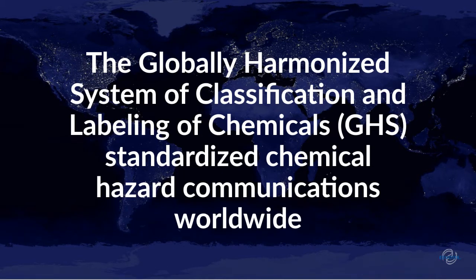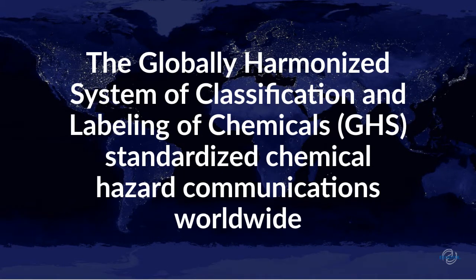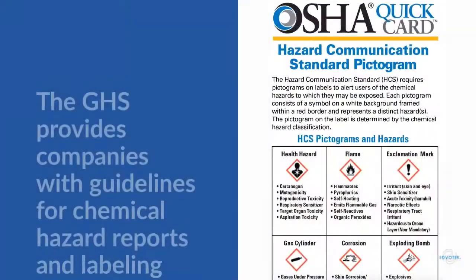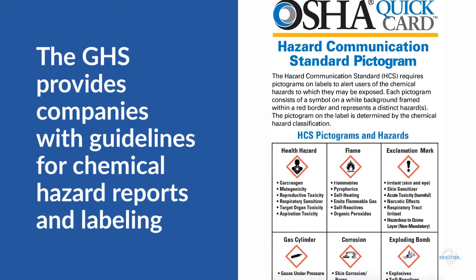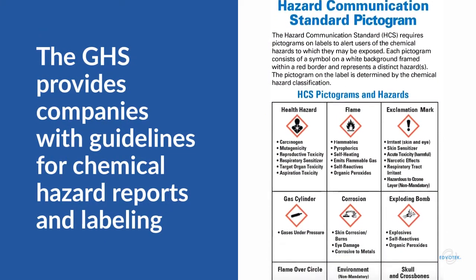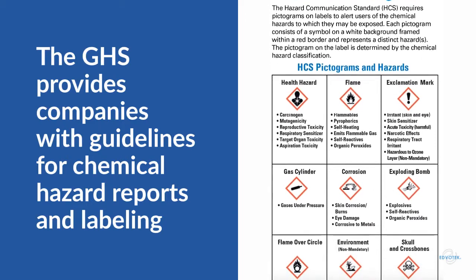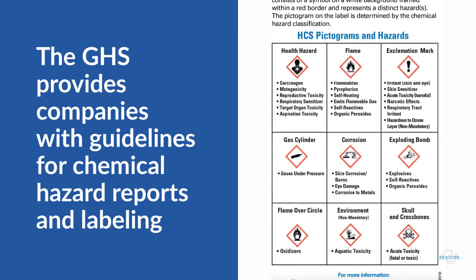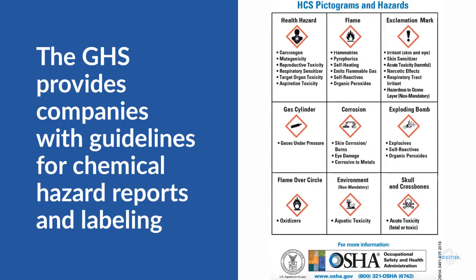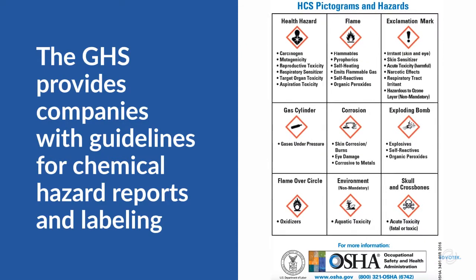This agreement standardized the way that companies around the world communicate information about chemical hazards from their products. The GHS provides guidelines on how companies classify a chemical's physical, environmental, and health hazards. It also defines a system to guide manufacturers on effective communication regarding these chemical hazards and ways to advise users on safe handling.